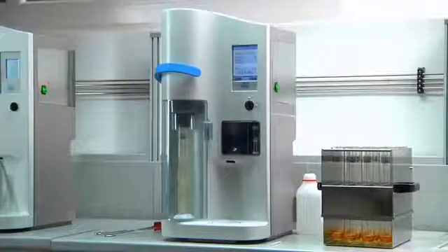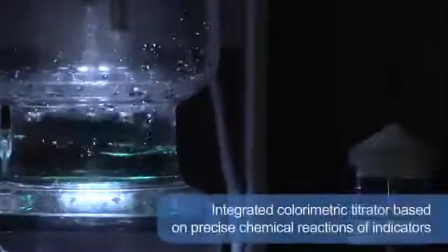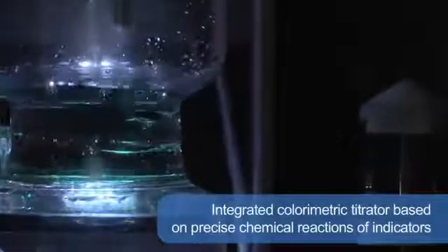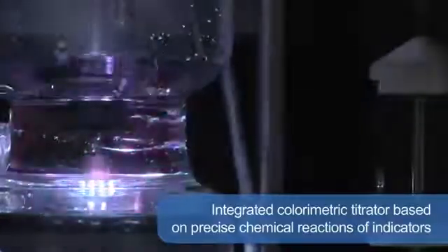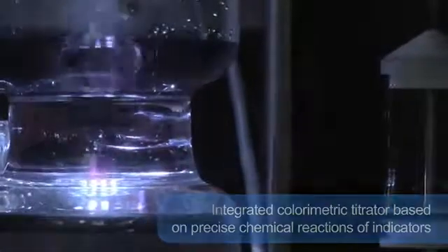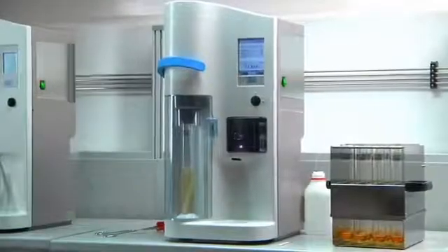The integrated colorimetric titrator provides reliable results as it is based on precise chemical reactions of indicators. The titration system is completely maintenance-free, as there is no need for time-consuming activities and additional costs for calibration. The automatic cleaning of the titration vessel eliminates any manual activity.